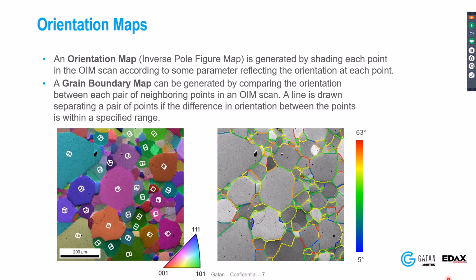And in certain types of microstructure, there are preferred boundaries. Like in nickel superalloys, you'll see twin boundaries that have a very specific misorientation. So you'll see these 60-degree boundaries. You can identify those as twins, but you can sometimes have phase transformations that will have a fingerprint of a given misorientation. So it's a very good technique for looking at misorientations over a large number of grains.